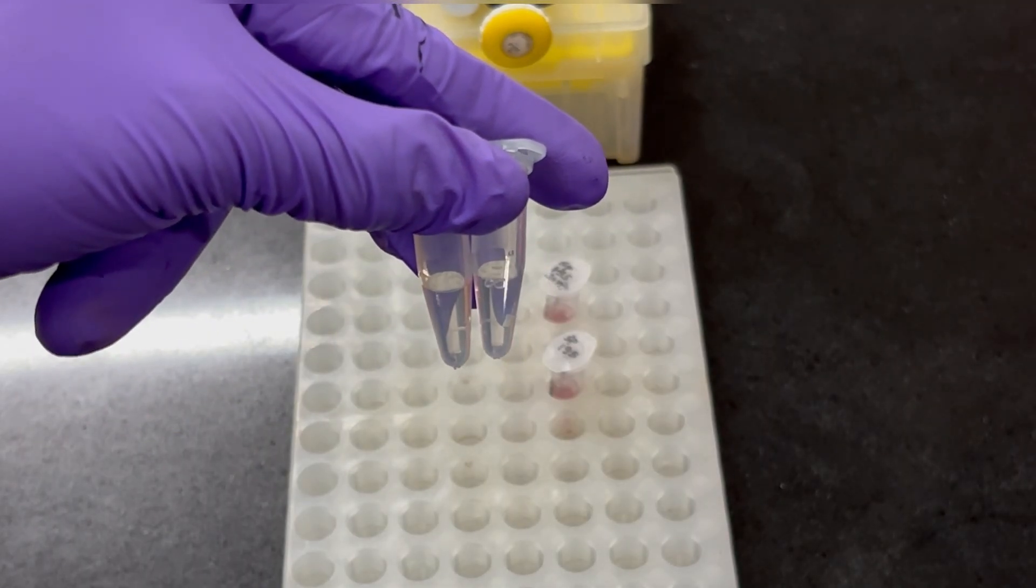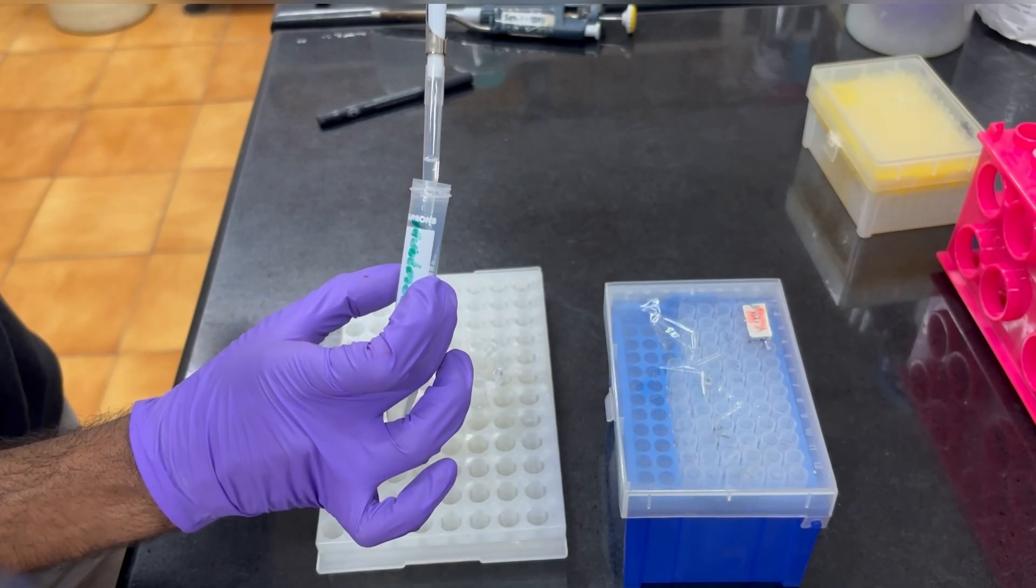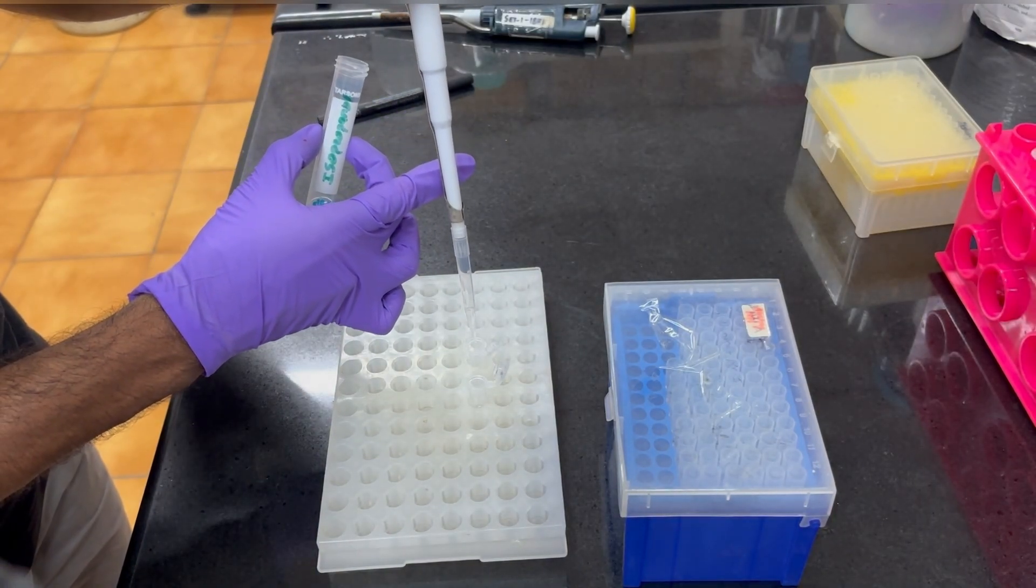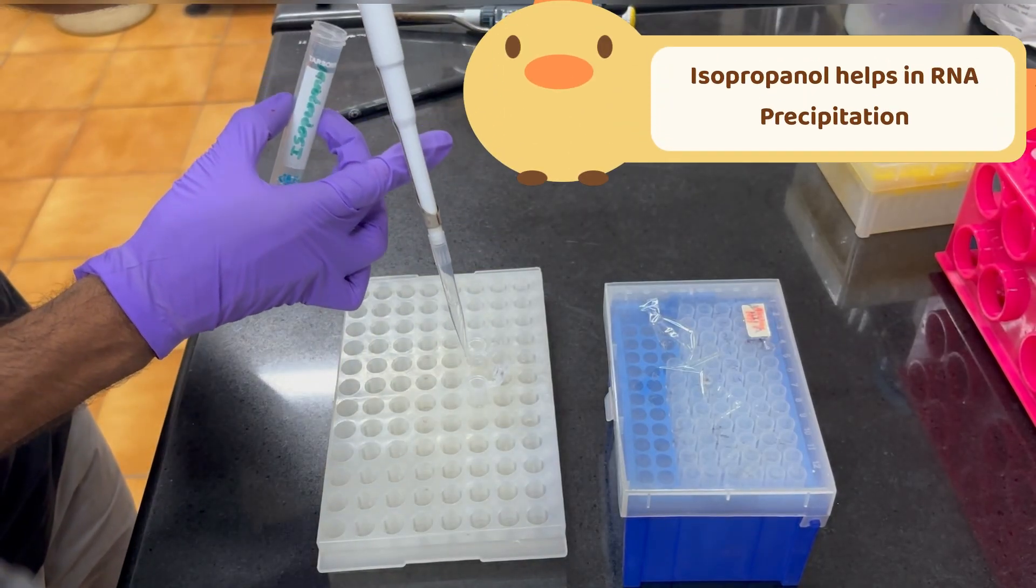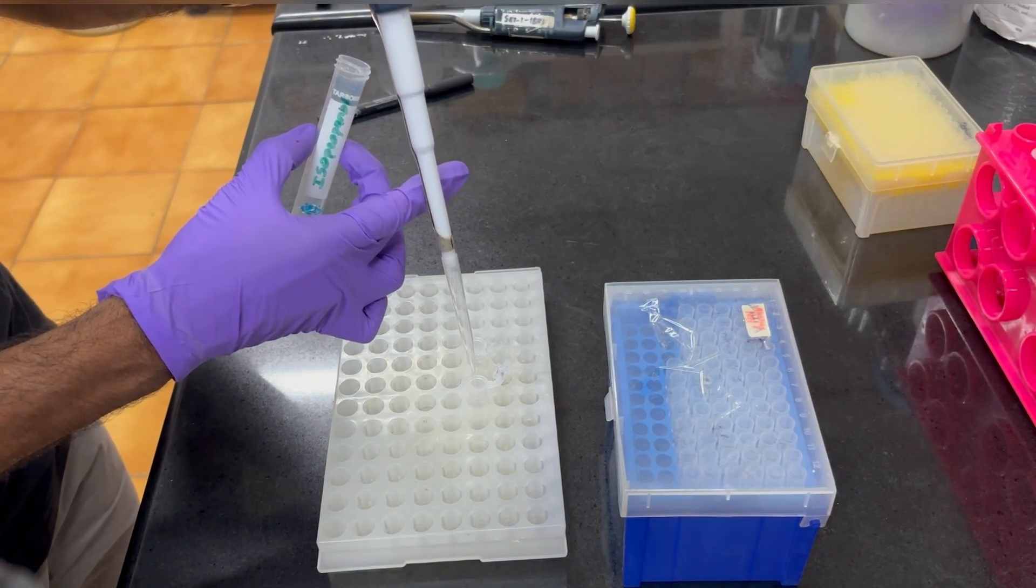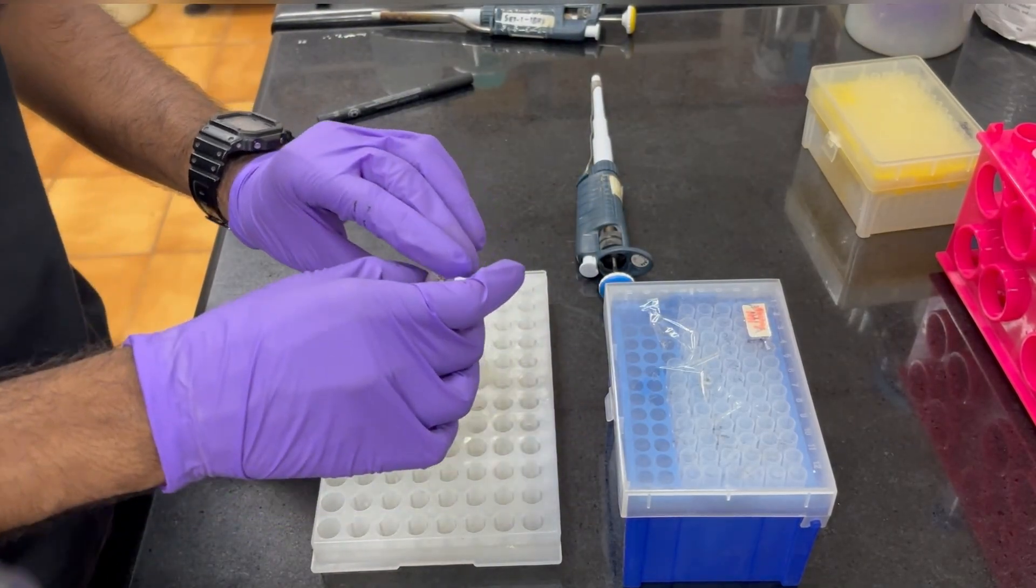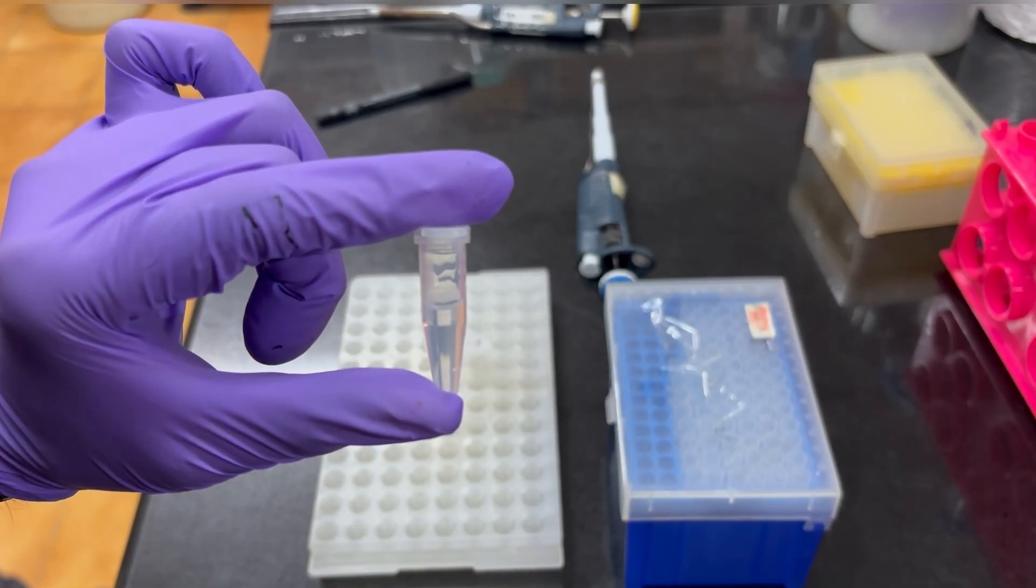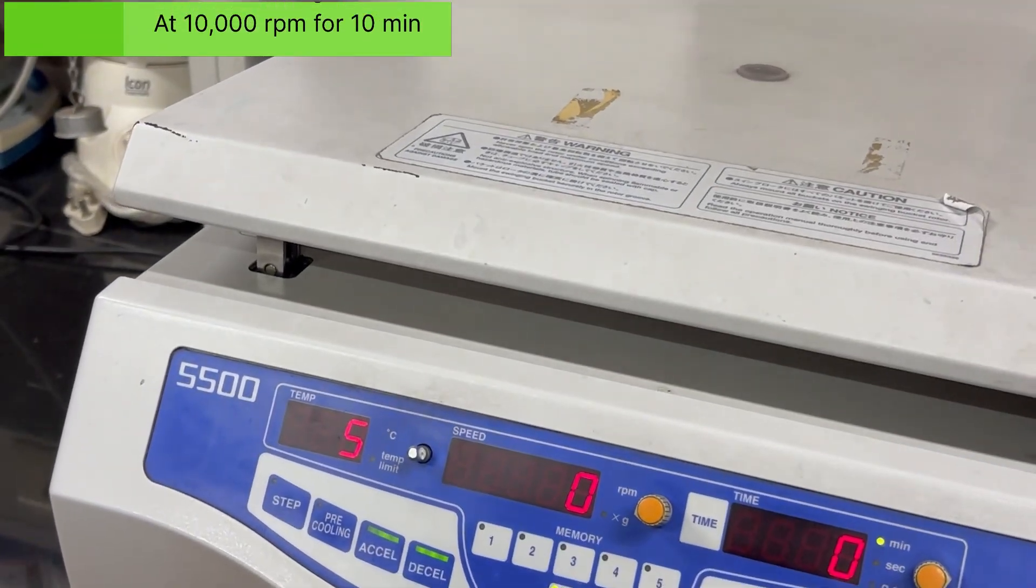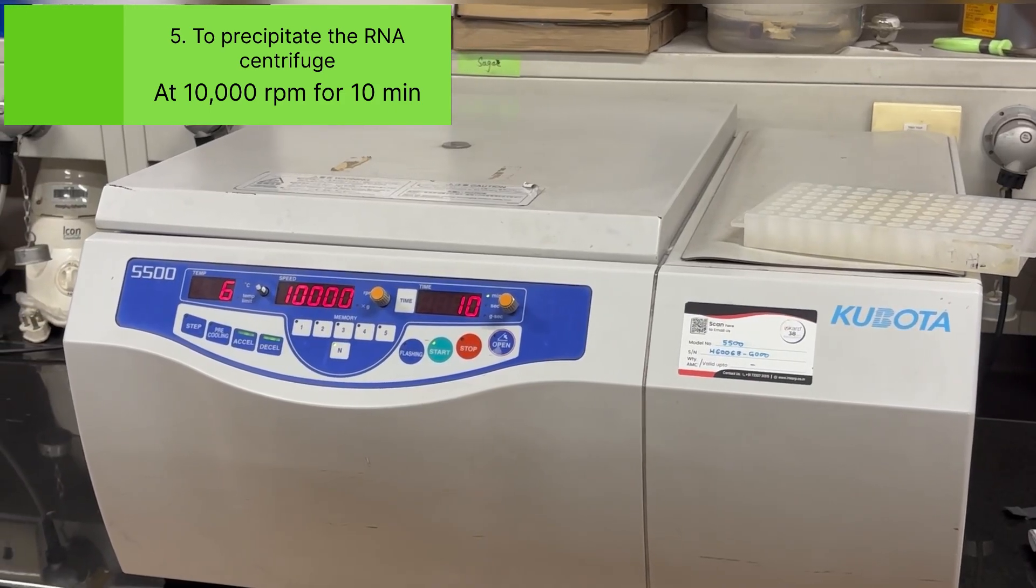The upper aqueous phase that we have collected into the fresh tube, into that tube add 500 microliter of isopropanol. Isopropanol helps in the precipitation of the RNA. So after adding isopropanol, you just make sure you are not vortexing, you just mix it like what I am showing here. To pellet down RNA, centrifuge at 10,000 rpm for 10 minutes at 4 degrees Celsius.